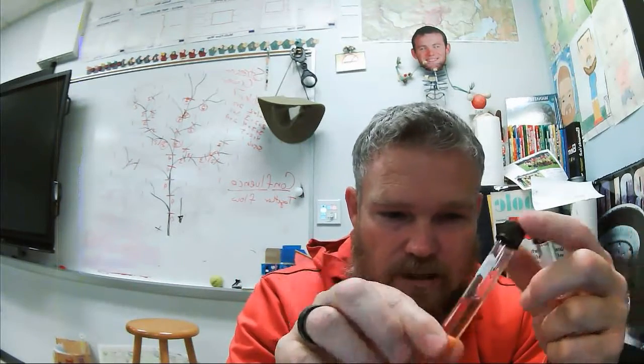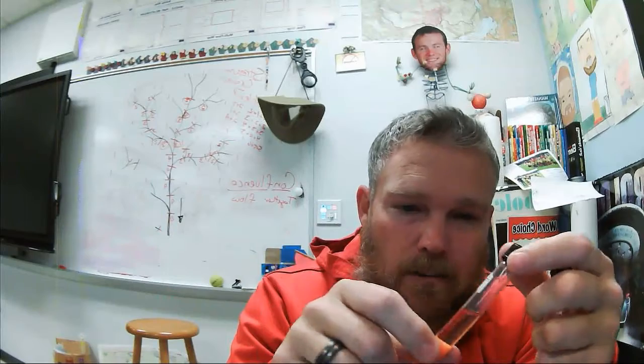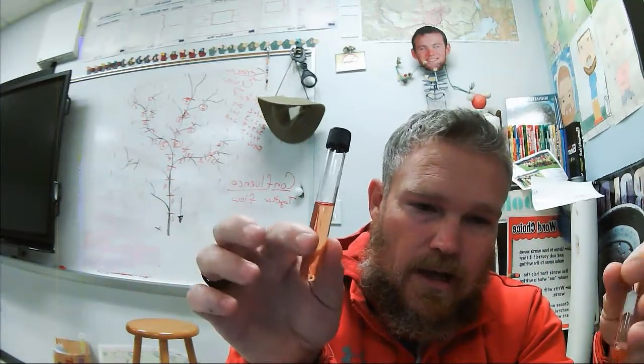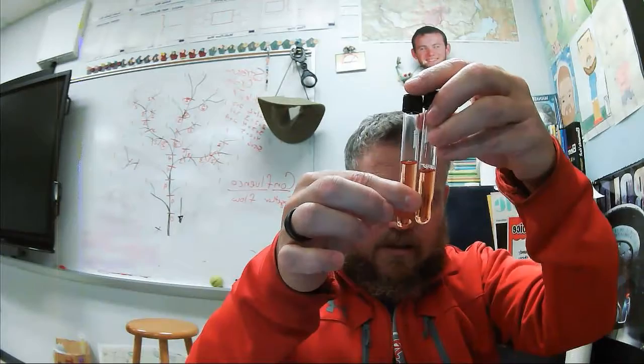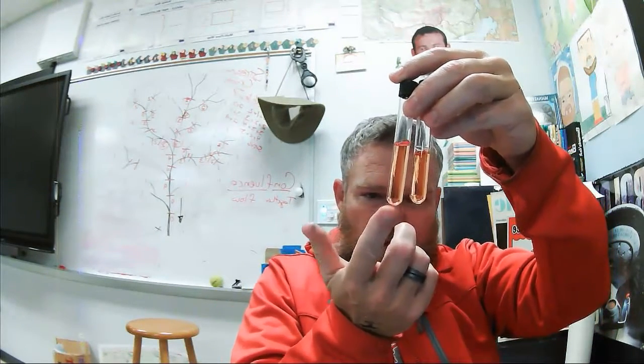So what we did here at the school is we went around and tested some different locations. Like this was location 1, which happened to be a toilet, and after 24 hours you go in and check the color. If the color is different, this one has not been used, and this one has 1 milliliter of water from a toilet here on campus added to it. Notice that color-wise, toilet water is clear. You could drink it. It's ready to roll.